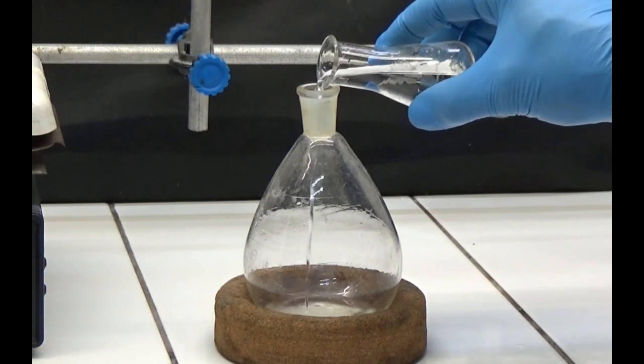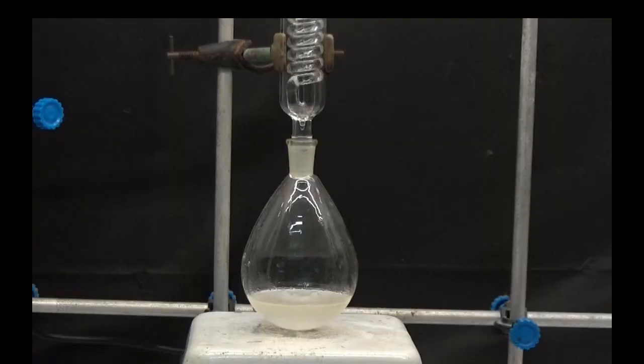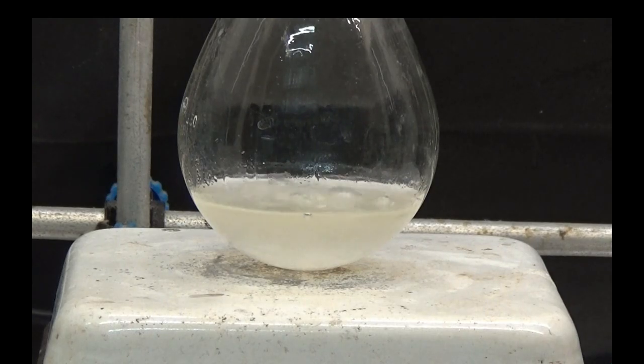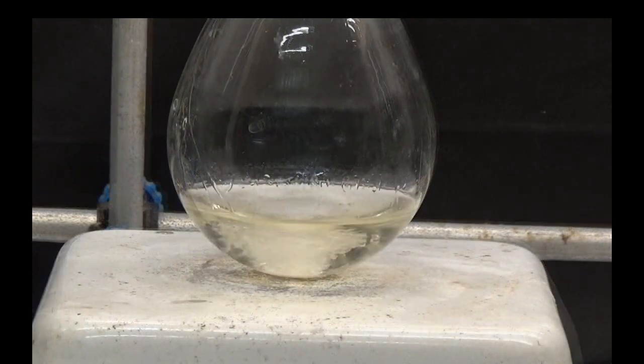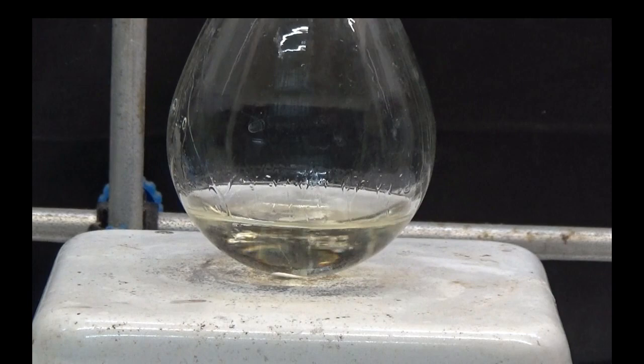Heat the residue under reflux with acetic acid solution. The reflux is stopped when the bonded layers are yellow, the reflux lasted about 4 hours.